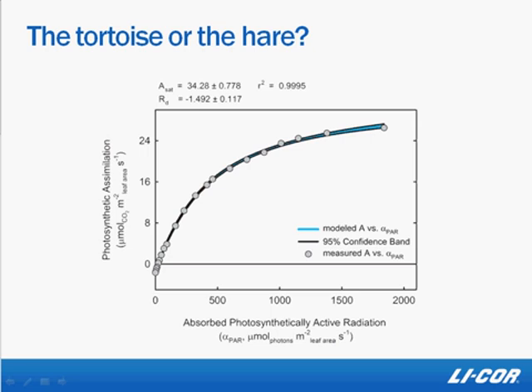Slow light response curves allow you to make sure that the plant is fully acclimated to each level in every way, but since each level can take up to 30 minutes, only a few curves can be done in each day. If you're interested in stomatal conductance at or around the compensation point, a slow light response curve is probably best. You might also be interested in quantum yields, and in that case, you wouldn't do the whole curve, you'd only look at a portion of it.